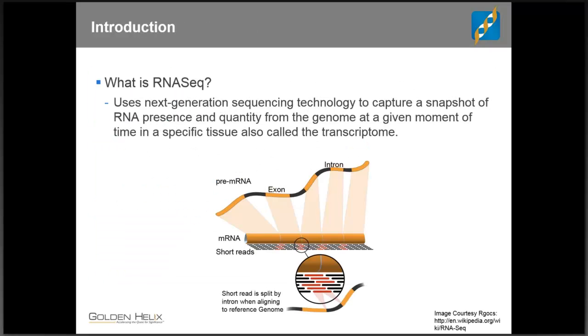So what is RNA-Seq? RNA-Seq uses next-generation sequencing technology to capture a snapshot of RNA presence and quantity from the genome at a given moment of time, also known as the transcriptome.